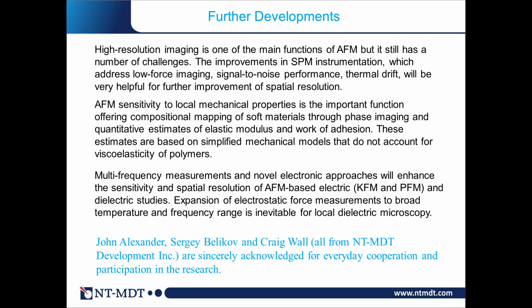What we want, particularly if we go to the oscillatory technique, is that we drive the cantilever in liquid and have only a single, sharp frequency response. That means you can follow the changes of the amplitude and frequency nicely. That both fail. Typically, the drive of the cantilever in liquid is very difficult, characterized by low Q.